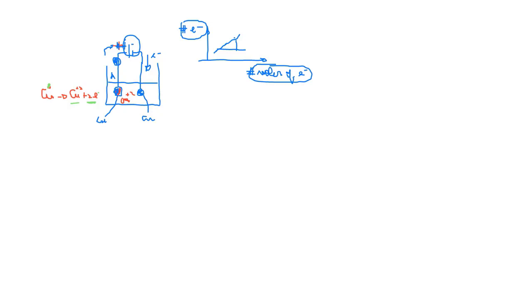How are we calculating the total number of electrons that is involved in this process? That will be done by measuring the current and the time.